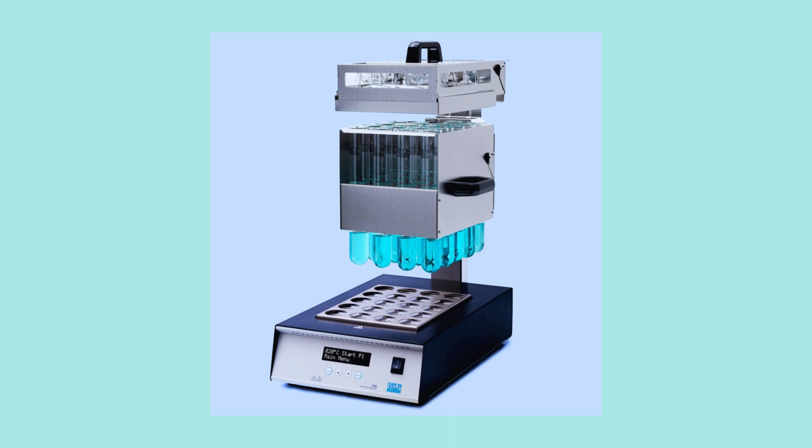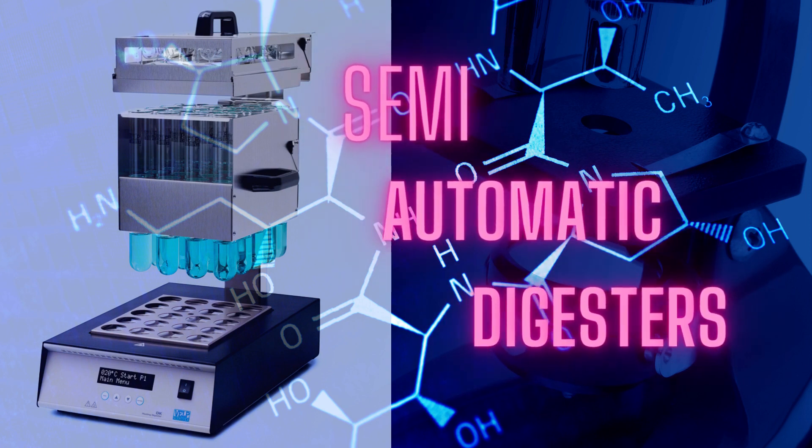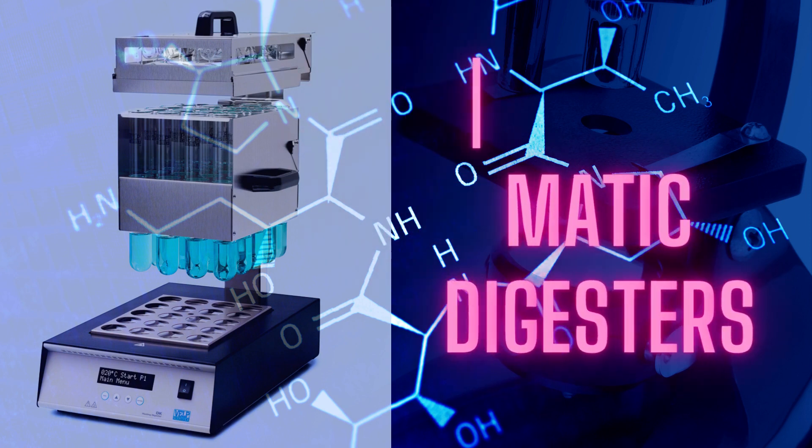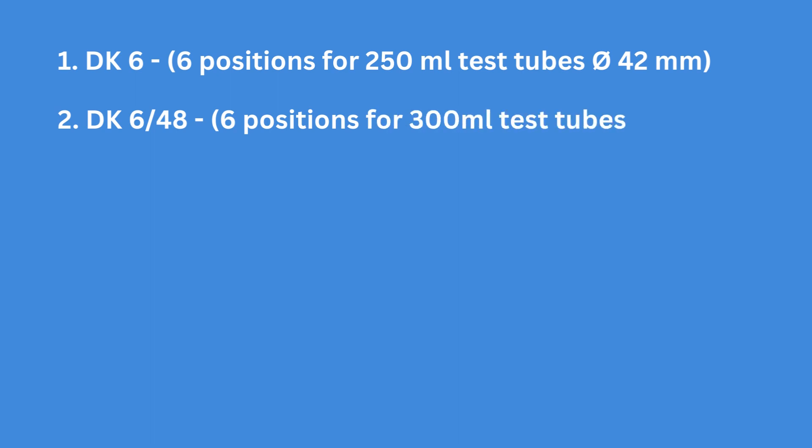VELP Scientifica offers a range of Kjeldahl apparatus known for their quality and reliability. Today we are going to look at the available models of the semi-automatic digesters. Number 1: DK6 — 6 positions for 250 ml test tubes in diameter 42 mm. Number 2: DK648s — 6 positions for 300 ml test tubes in diameter 48 mm.